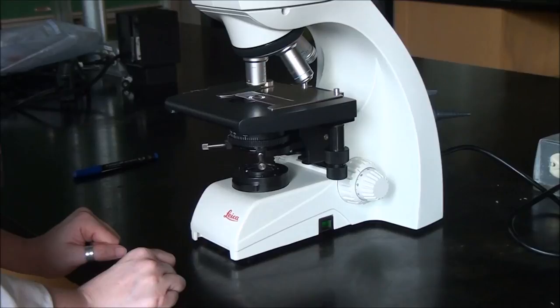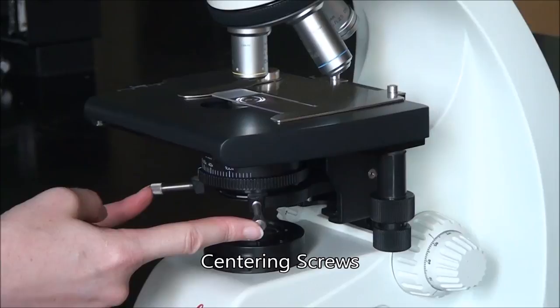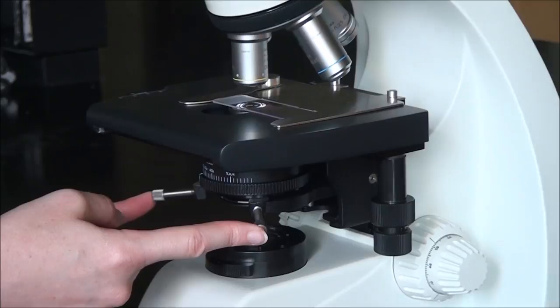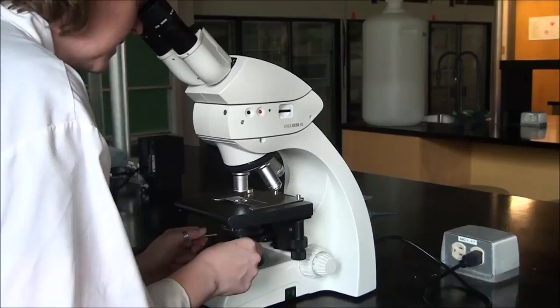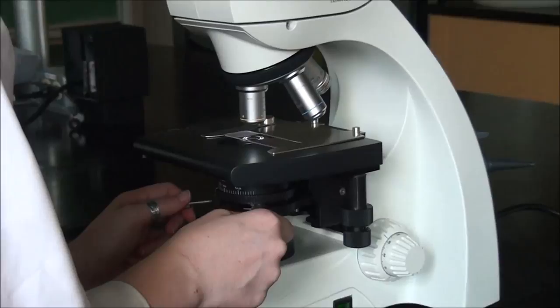To center the circle of light, we are going to be using these two large centering screws. This is the only time that we get to use these centering screws, when we're setting up Köhler illumination. Remembering to look through the oculars the whole time, you're going to make fine adjustments with these two centering screws to make that circle of light or heptagon of light occupy the very middle.